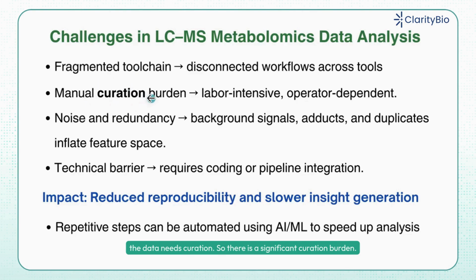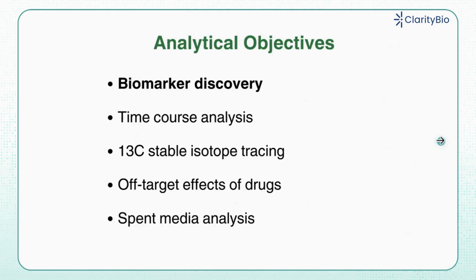So there is a significant curation burden. While curation is required, many softwares don't allow an easy pathway for curation, and that then becomes labor intensive and operator dependent. There is noise and redundancy, so that needs to be removed. And overall, the softwares present a significant technical barrier. So these were the motivation that we had while developing this software.